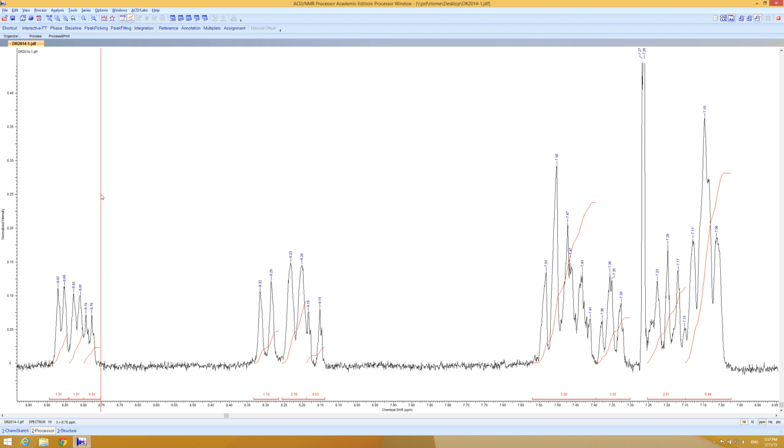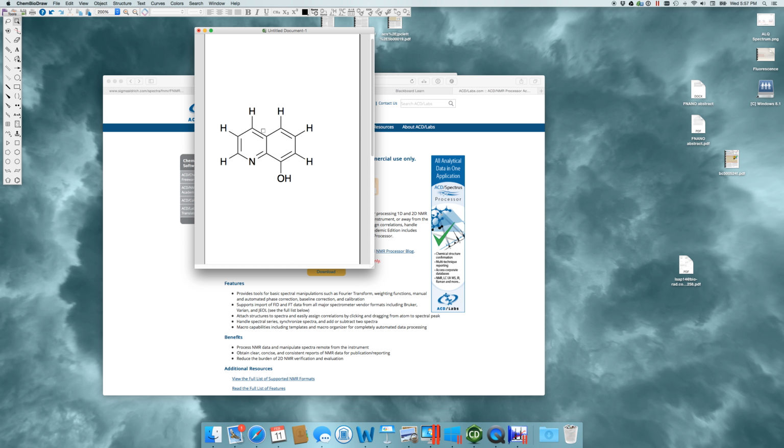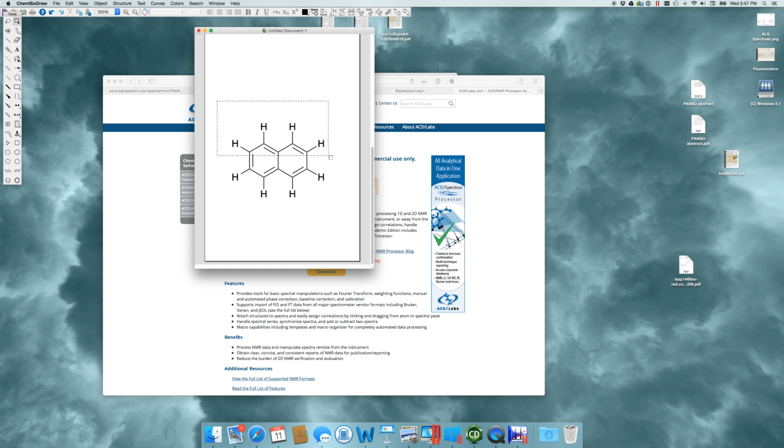And based on your quizzes, I think maybe we should just really quickly go over it. All right, this is naphthalene, a very symmetric molecule. You'll notice up here, these 4 protons are exactly the same as these 4 protons. That means that in the NMR, because they're symmetrically equal, their chemical shifts are going to be equal.